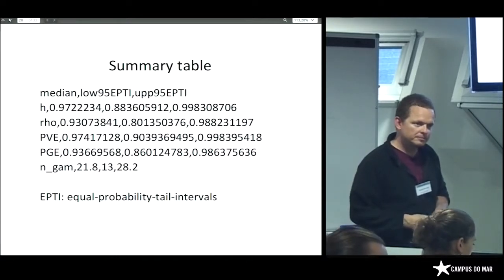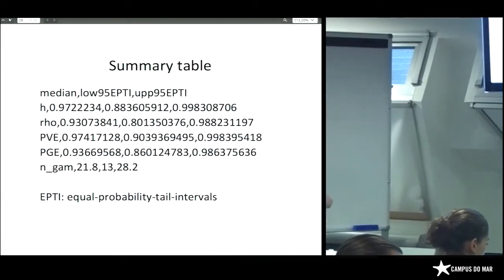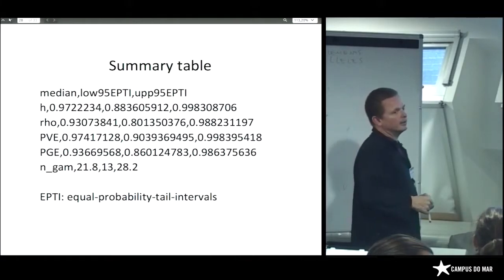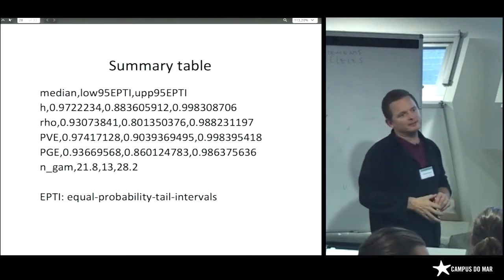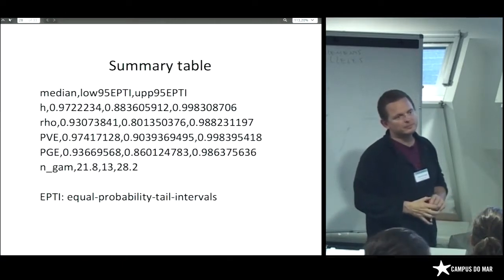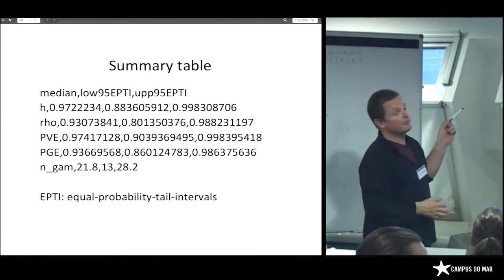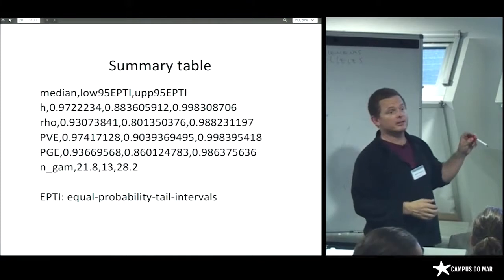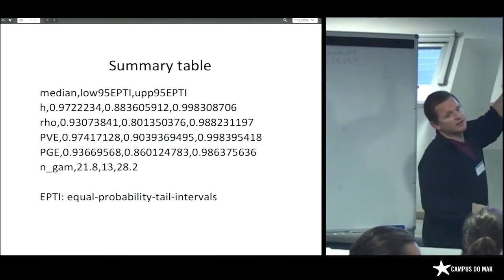How can we be sure that that's not correct? And if we're using a file that's continuous data, and we cannot use the other model, and we obtain the same data. So there are many other models that you can run. This is just using the Bayesian models that I've been talking about. You just need to use your common sense.